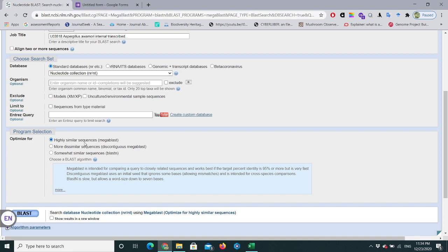Highly similar sequences means your sequences are identical by more than 95%. You can use this option to find similarities between those sequences, so we commonly use MegaBLAST for highly similar sequences. If you have dissimilar sequences, MegaBLAST won't work well. In that case, if you have sequences from different species or across species, you need to select 'More Dissimilar Sequences (Discontiguous MegaBLAST)', which handles mismatches between sequences.